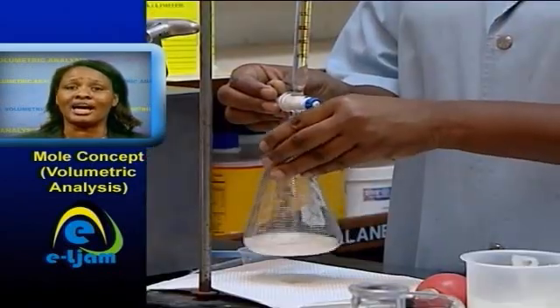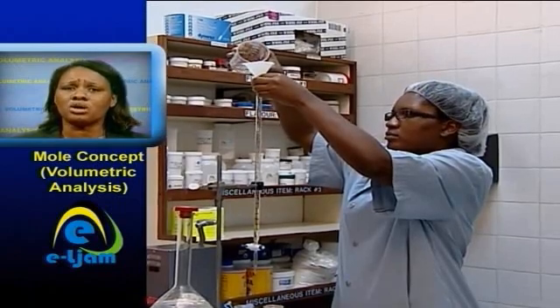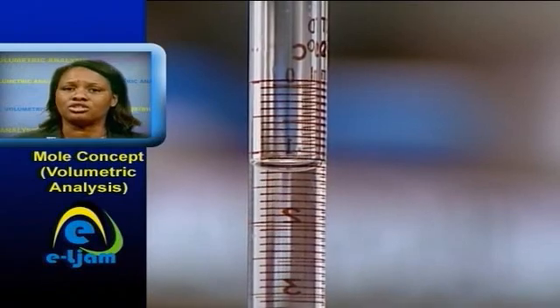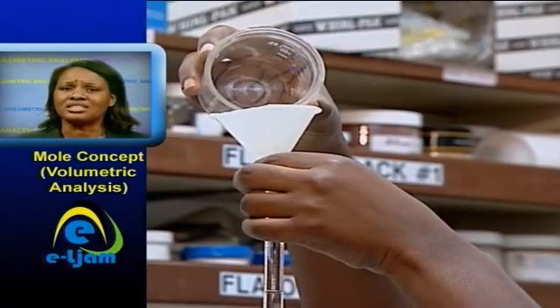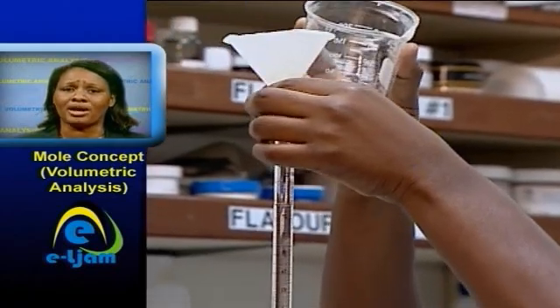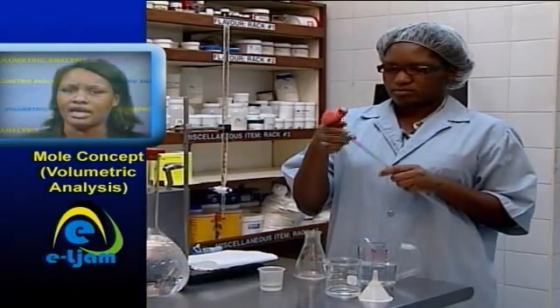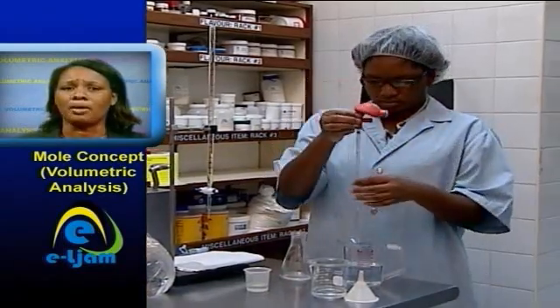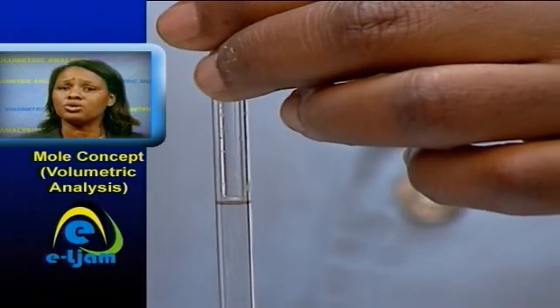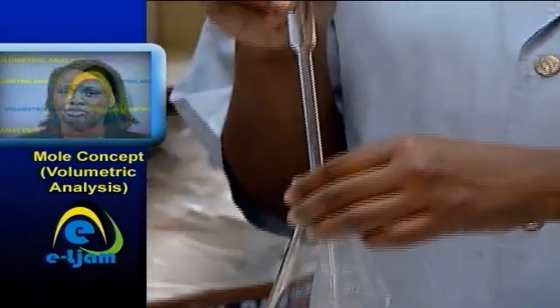This is the analyte. The reactant of accurately known concentration is referred to as the standard solution. The standard solution is usually used to fill a burette and is referred to as the titrant. The analyte is usually measured into an Erlenmeyer flask, also known as a conical flask, using a pipette.